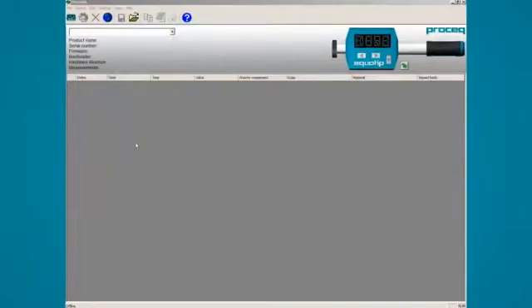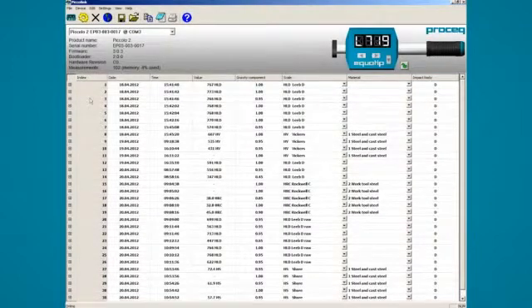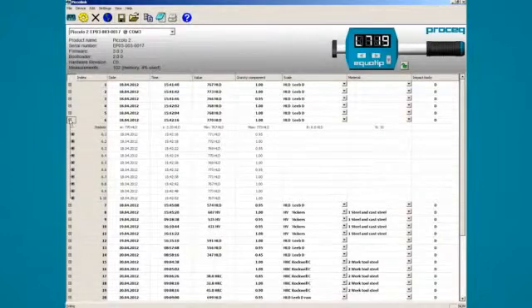The EchoTip Piccolo comes with the data analysis software Picolink. After launching the software, please click the EchoTip Piccolo icon on the top left to connect to the instrument and transfer the measurement data. All the measurements that were taken with the EchoTip Piccolo are now displayed. You can expand the view by clicking on the plus. Here you can see the details of your measurement series.